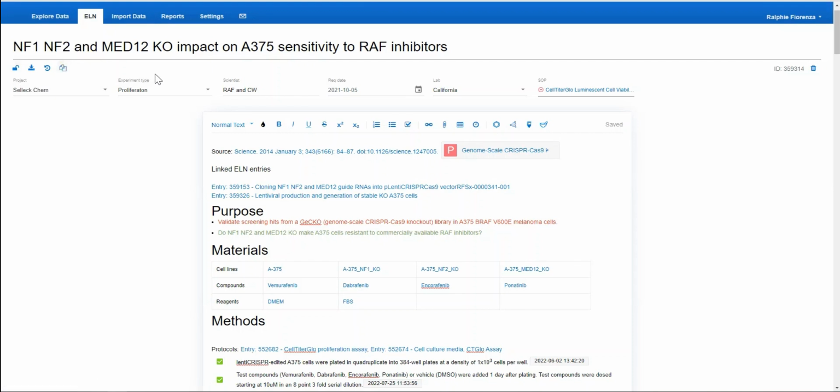In addition, you have these configurable user-defined metadata fields within the ELN, allowing you to capture additional information such as experimental types in controlled vocabulary pick lists, free text fields, date pickers, and file attachment fields. These fields are intended to help you sort through your complex ELN entries.